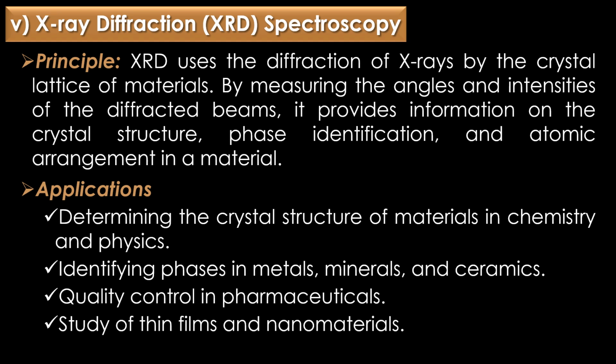Regarding the applications of XRD spectroscopy or X-ray diffraction spectroscopy, it is very helpful in determining the crystal structure of materials in chemistry and physics, identifying phases in metals, minerals, and ceramics, quality control in pharmaceuticals, particularly polymorph identification, and the study of thin films and nanomaterials.